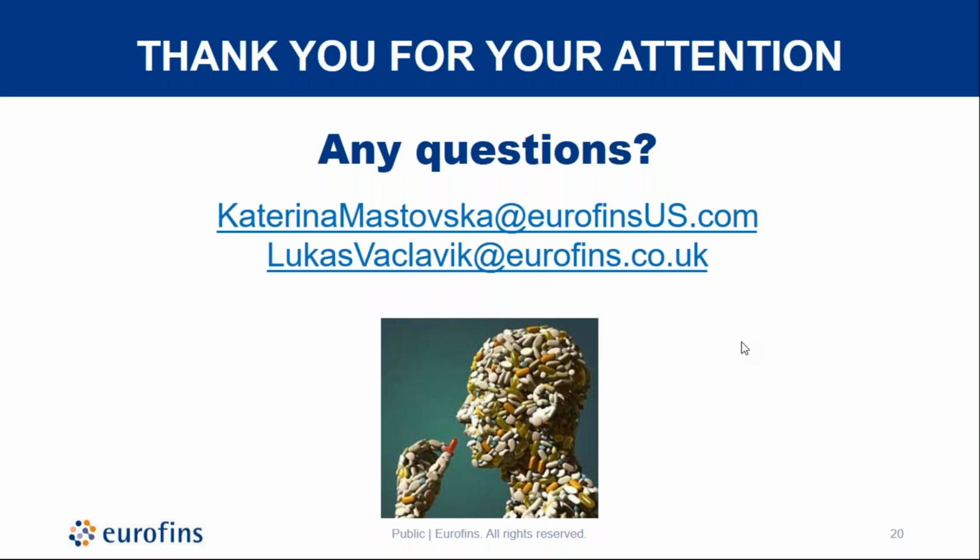And another approach we typically take for ensuring accurate quantification is the standard addition method, which allows compensation for matrix effects, but also compensates for any analyte losses during the extraction or instrumental analysis. So this is really the best option we use, and we employ it when we really need highly accurate quantification. Wonderful, thank you.